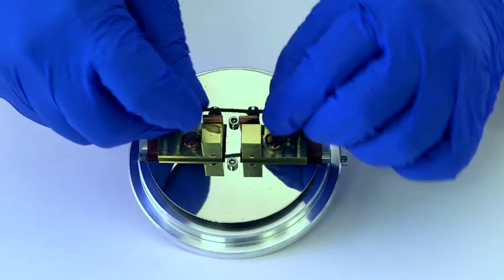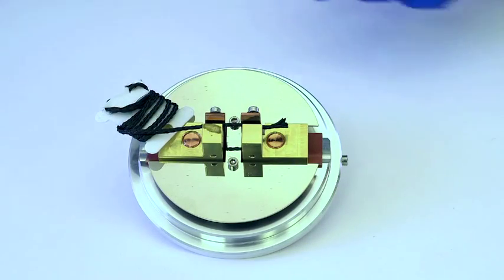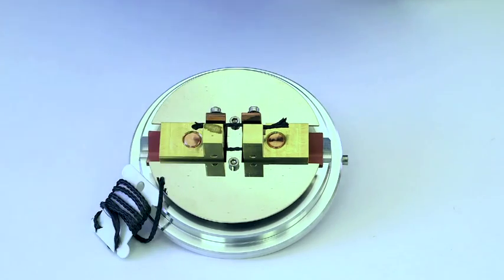If carbon fibre evaporation is preferred, an optional fibre insert is available and an insert capable of upward or downward metal evaporation is also available.